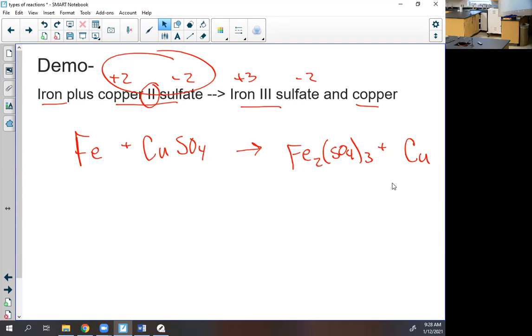See the difference, Cohen. What? Yeah. Actually, probably not. That'd be bad. This is bad technique, but I'm going to do it anyway. I don't know that this will show up on camera very well, but we'll go for it.